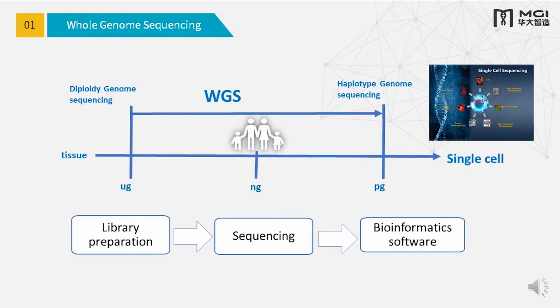And also from the tissues, you get thousands of cells, live cells and dead cells, from the biological samples, and then we can sequence with less and less biological sample. Finally, we can reduce to the single cell. At the moment, single cell whole genome sequencing has been used for embryo sequencing and also tumor sequencing. Because I think 5 or 6 years ago, single cell sequencing from tumors was really popular and published lots of papers in very high impact factor journals.